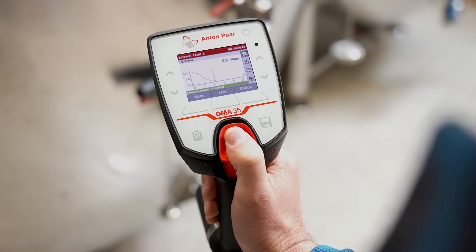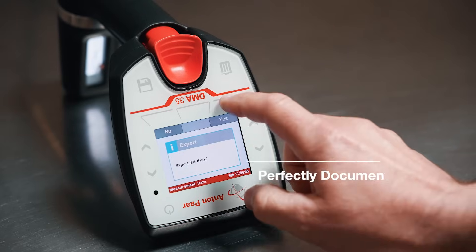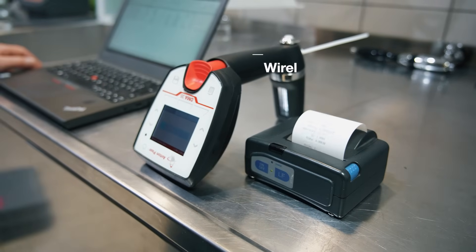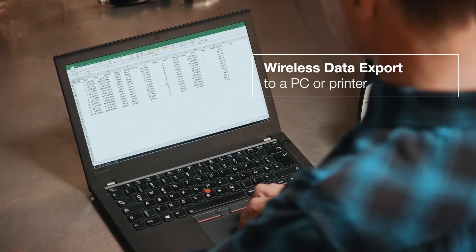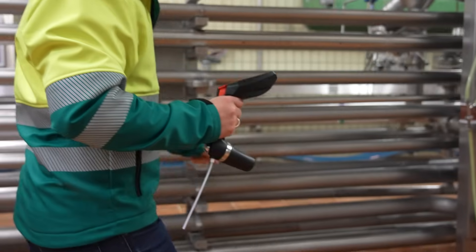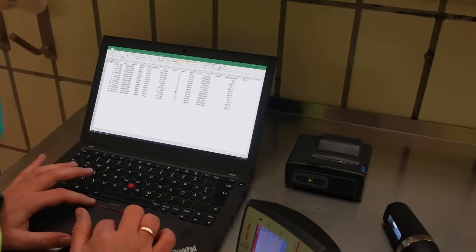Keeping track of each tank's fermentation process is easier than ever. When it comes to data export, our options have you covered — print results directly from the instrument or export them to your computer via Bluetooth right away. All of this because we know what consistency and speed mean for your brewing process.